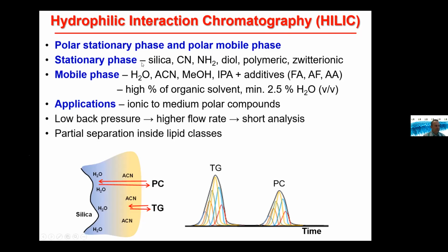which is definitely more user-friendly, and I can recommend using it because it's very simple and convenient for quantitation. Here, we have a polar stationary phase and a polar mobile phase, which explains why non-polar lipids cannot be retained in this system. Non-polar lipid classes such as triacylglycerols and cholesterol esters elute in the void volume of the system, and you cannot improve it and separate them due to the characteristics of this system.